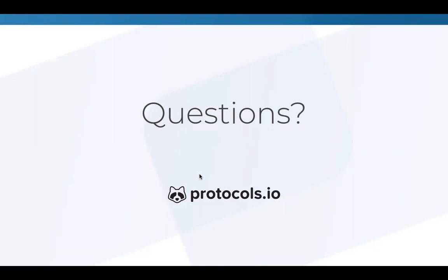Right. If you go to the protocols.io site, at the very bottom there's a developer tab, and you can click there and find all the information you need. Or you can also email me later if you have any more detailed technical questions about that. But it should be possible, yes.